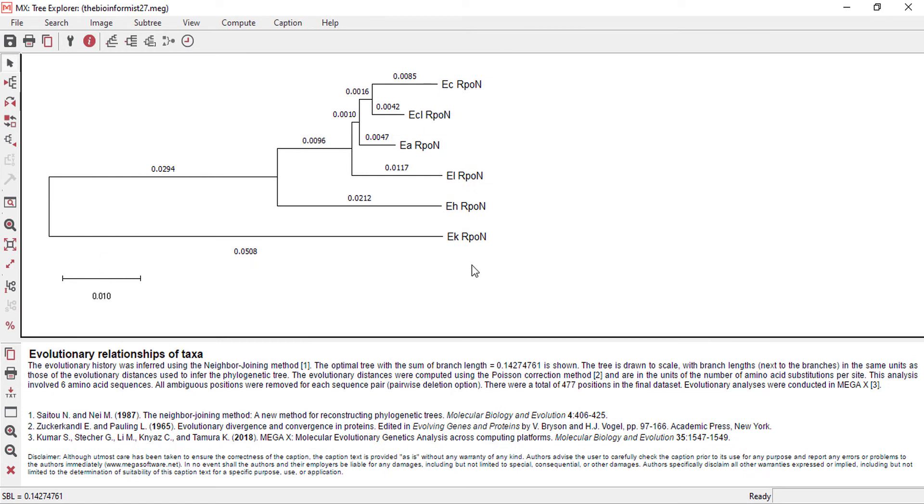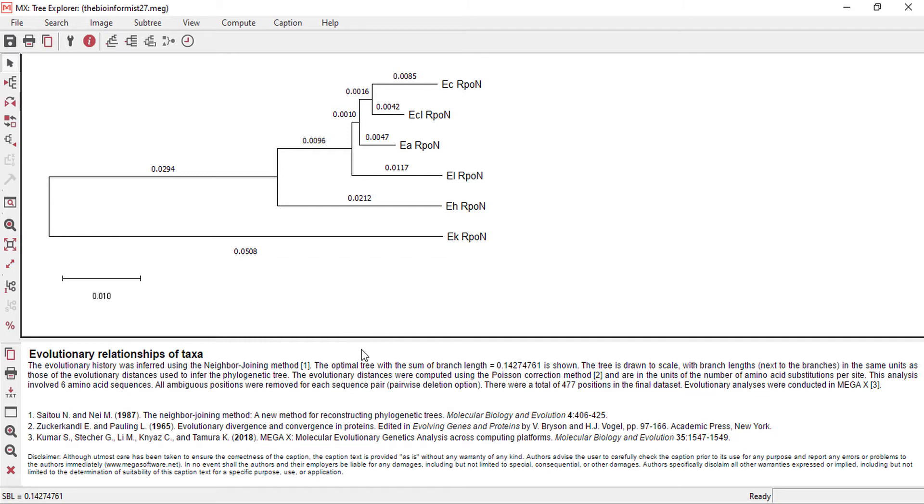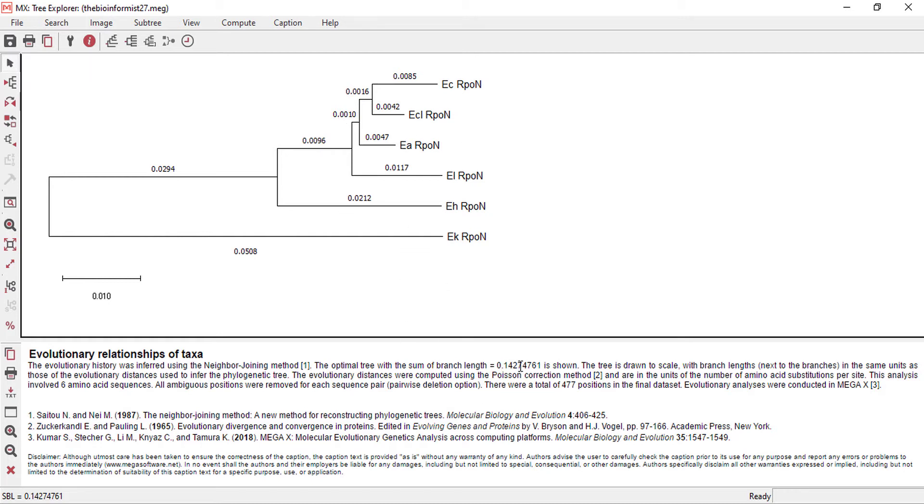Here we can see all the proteins that were aligned with the mega file with different branches and a brief description about the tree. The evolutionary history was inferred using the neighbor joining method that I chose to construct this phylogenetic tree. The optimal tree with the sum of branch length is equal to 0.1427. This is the sum of branch lengths as we have different branches in the tree. If we sum all the branch lengths, it will give the result 0.1427.